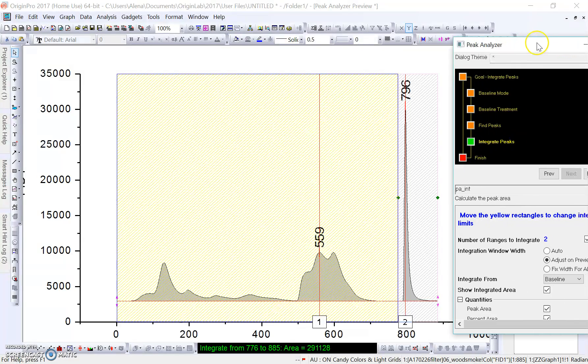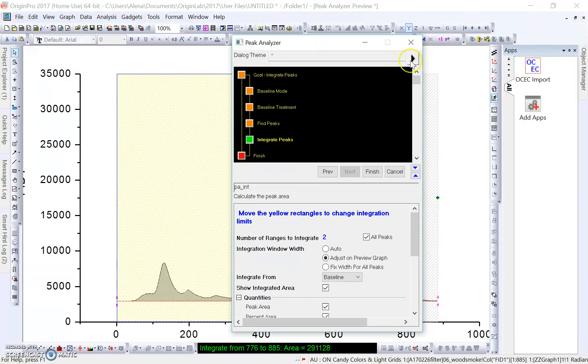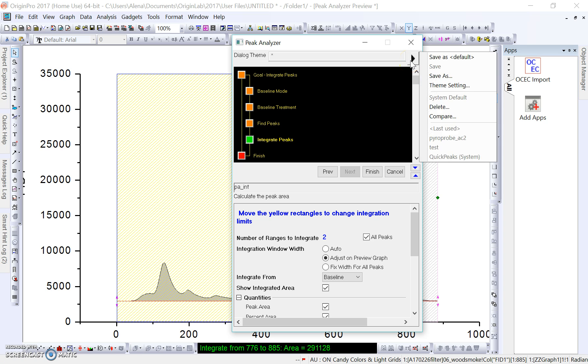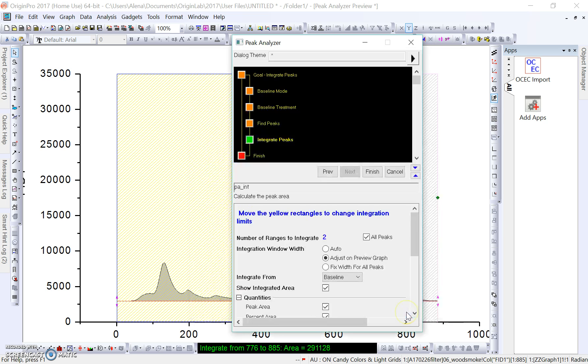Bring back our Peak Analyzer box. At this point, before clicking Finish, we're going to actually save this dialog so that we can use it for a later time. I'm going to label this pyroprobe_AC because that's the current method we are using for our instrument. I'm going to save that by clicking OK, and now we can click Finish.